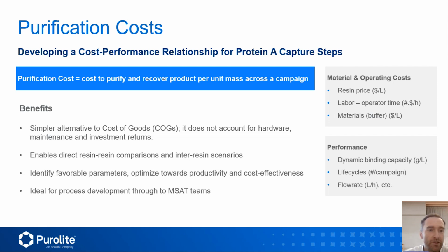There are several benefits to this. It's a simpler, easier to use alternative to cost of goods. It doesn't account for hardware, maintenance, or investment returns, or even dosage costs. It enables head-to-head direct resin-to-resin comparison evaluations, as well as inter-resin evaluations looking at different scenarios, such as different bed heights. It also allows you to identify favorable parameters and optimize towards productivity and cost effectiveness.